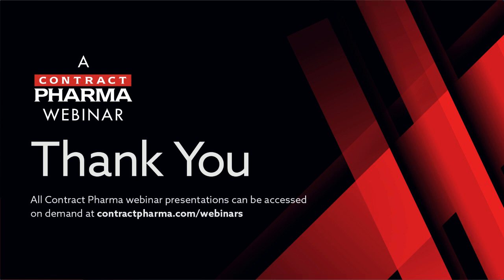And there's a webinar on the Sotera Health Academy that's going to talk about proper uses of sterility testing and why you wouldn't want to use sterility as part of stability. So yes, please replace sterility with CCI testing for stability.